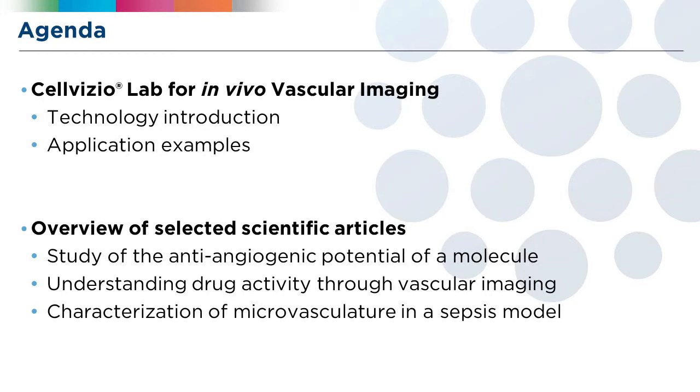During this webinar, I will discuss applications of Cellvizio Lab for in vivo vascular imaging. In the first part, I will give you an introduction of the technology and give you some examples of applications where Cellvizio Lab was used to characterize vasculature in vivo.